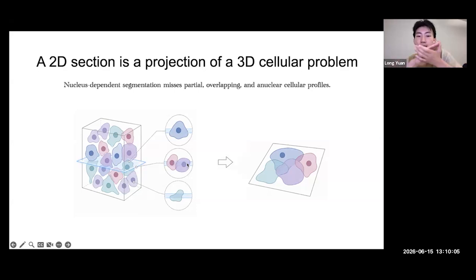Most existing segmentation approaches borrowed from the computer vision field are forced to decide: assign transcripts to the nearest nucleus, leave them unassigned, or bin them. Tracer asks a different question: do the transcripts assigned to an object form a biologically coherent entity?